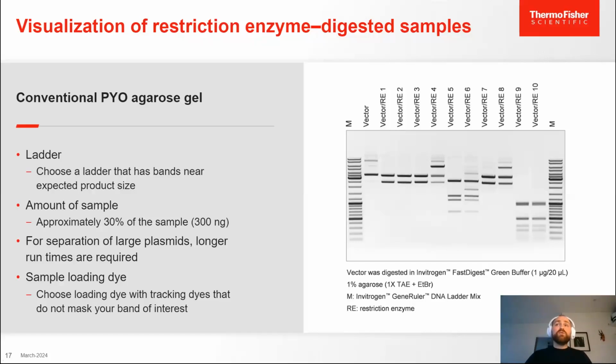If you have performed a PCR experiment and your PCR is not specific enough, you cannot essentially design specific enough primers for your fragment of interest. You will get very similar results. So knowing exactly the size of your fragment becomes absolutely crucial, because you might have just smears, or multiple bands after many optimizations, but you would be very confident that this band is what you are interested in.